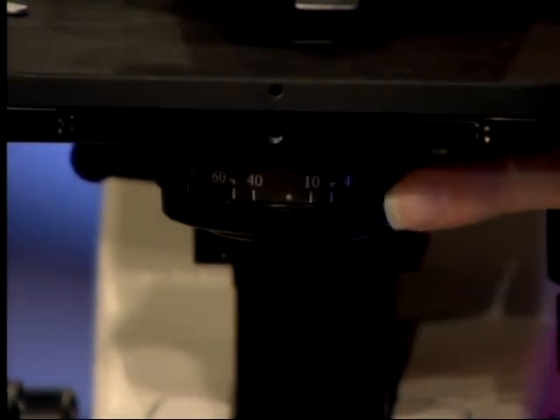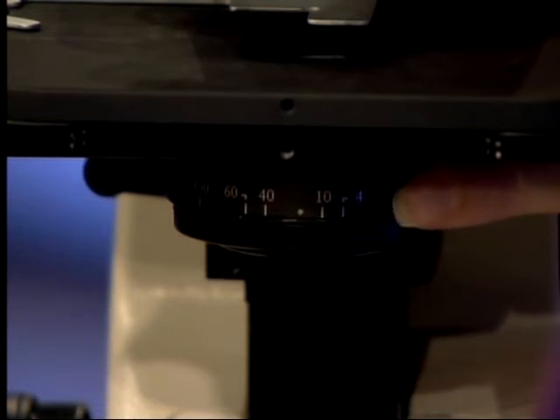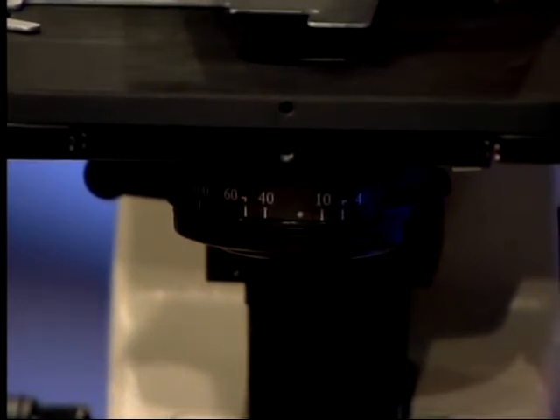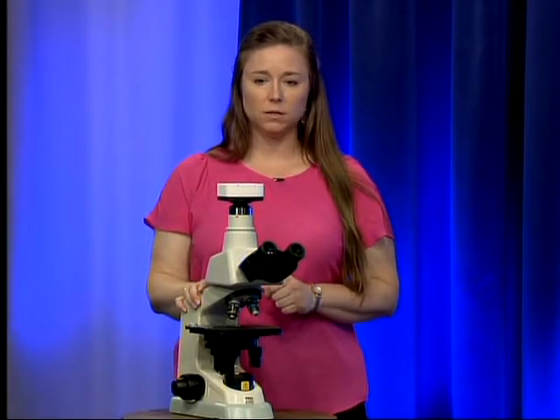Right underneath the stage we have the condenser. This condenser is fixed, meaning it does not move around and cannot be taken out and replaced with a different kind of condenser — it has been set at the factory by the manufacturer. This also means that you do not have to do Köhler illumination on this microscope and you never have to adjust the alignment of the condenser. If it does get out of alignment, we will have to have the vendor work on it.